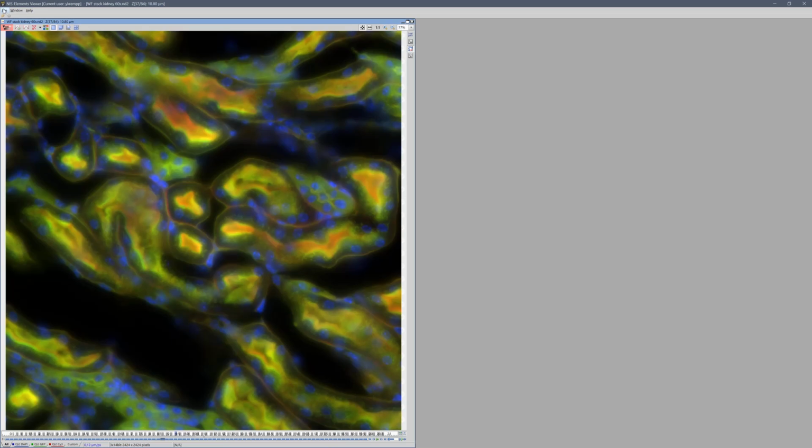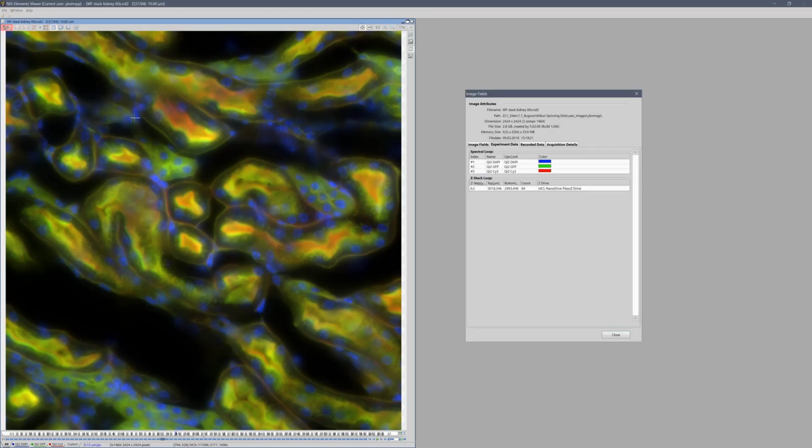And if I want to get the information I need, I can go here to Image Properties, and you will see something similar on each of the viewers from any microscope brand. They deliver a free software to view the images, and you will probably have at some point a menu or something to display this information.